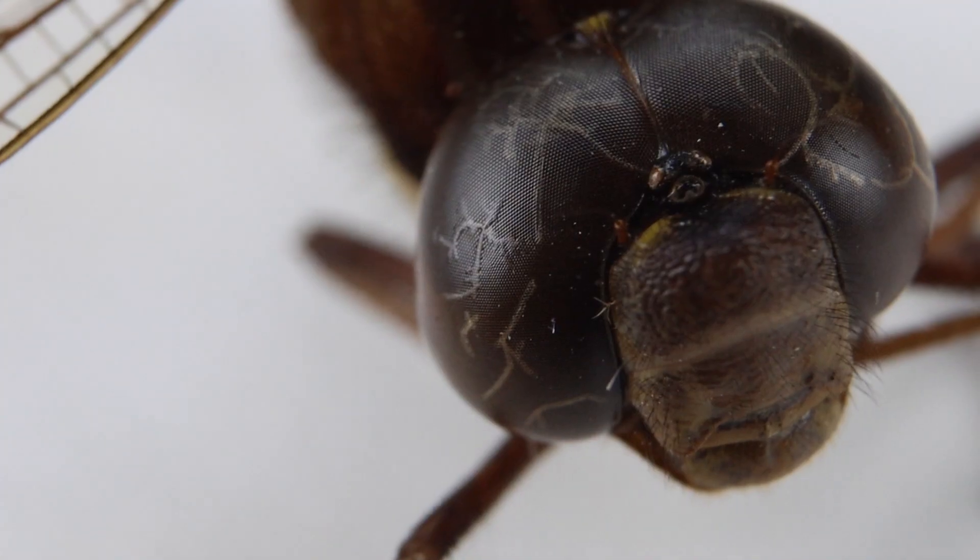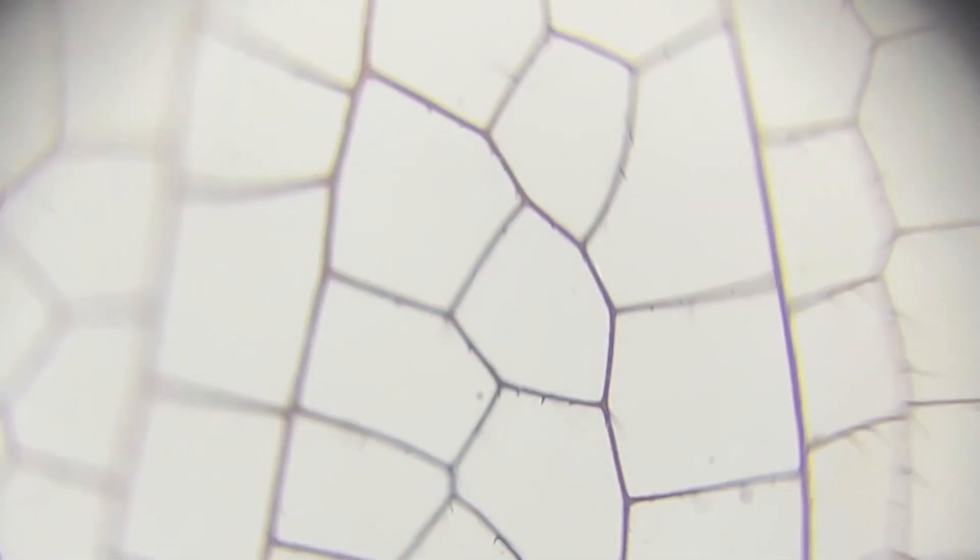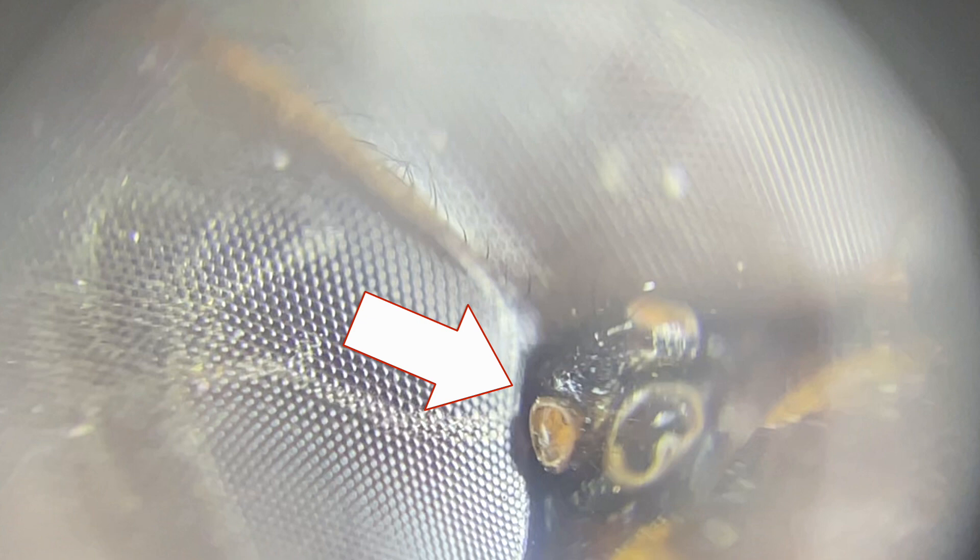But maybe you're not interested in cells — maybe you're more of an insect person. We actually found this dragonfly on the floor of our garage, perfectly preserved. The zoom and image quality are sufficient enough that you can actually see the tiny hairs coming off the individual fibers of the wing. And as we zoom in and look at the compound eye — don't even try and act like this isn't the grossest thing you've seen in a couple of weeks.